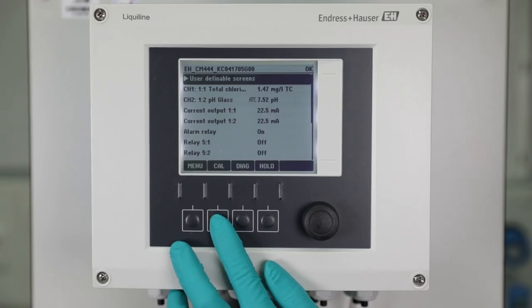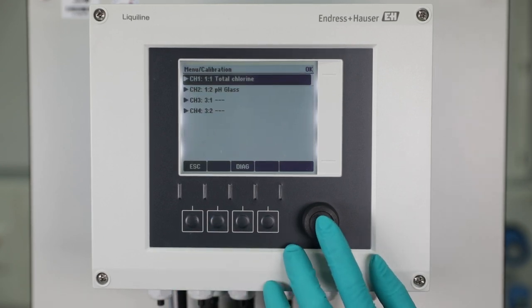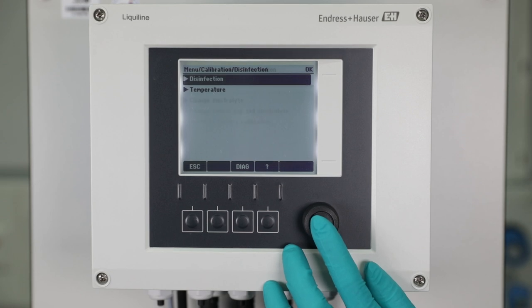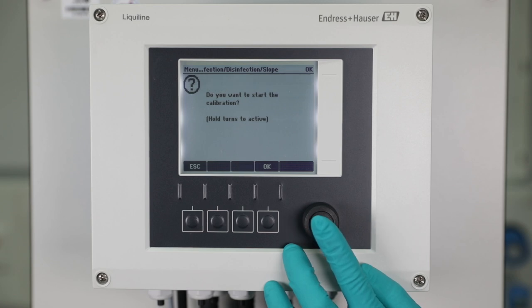Now start the calibration procedure at the liquiline transmitter. Therefore, press Cal, choose Disinfection, again, then Slope and come to Sample Calibration. Start the calibration and press OK.